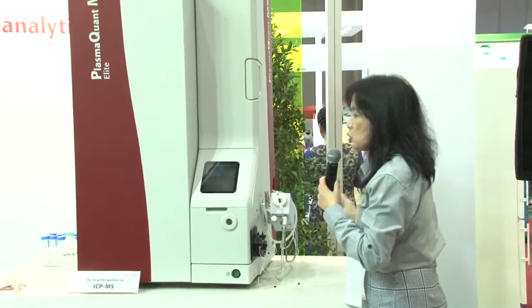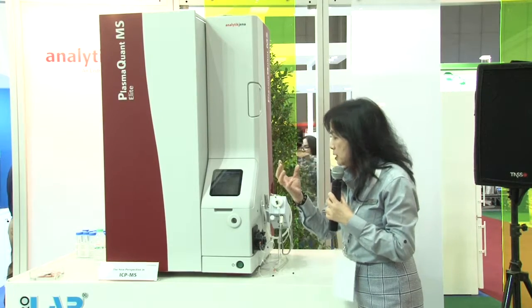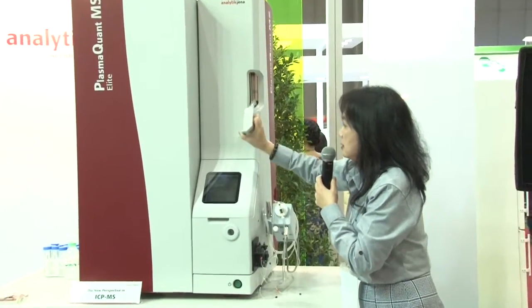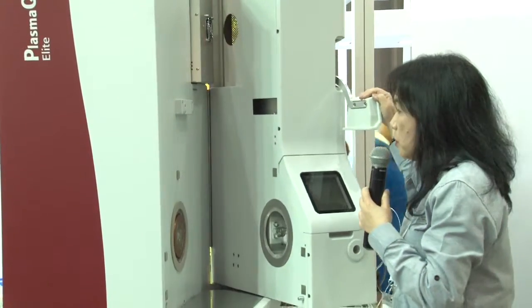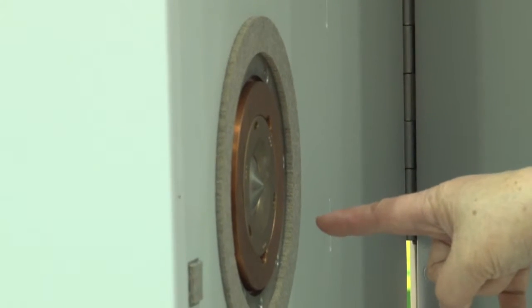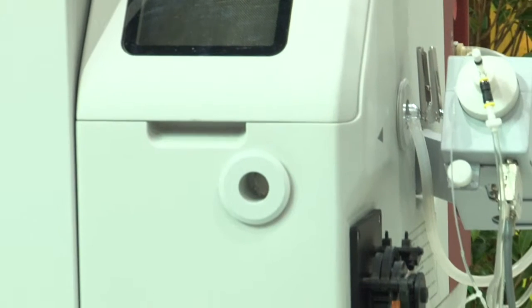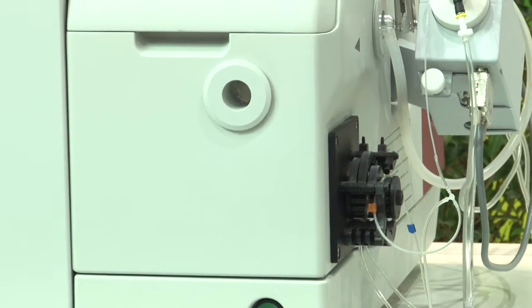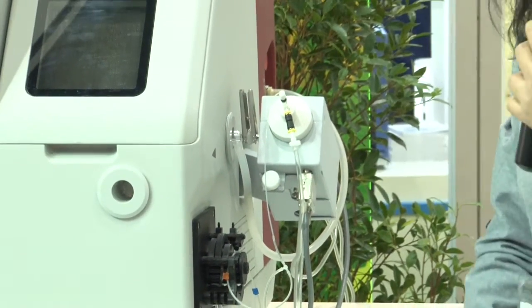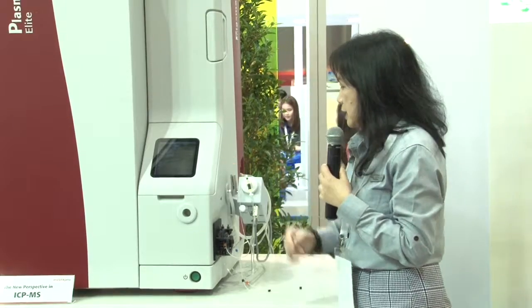After we measure all the samples and all the calibration standards, if you wish to do maintenance, the only maintenance you need to do is the cones. It's so easy. I just pull the lever and open up. It's like an open book. Then you see the sample cone and the skimmer cone. After you clean them, take them out, and put them back on, you close the door and continue running. Of course, you don't need to clean the cones every time; I just show you how you do the maintenance. It's very simple and easy. Operating ICP-MS is not as difficult as some people might think. Although people think ICP-MS is so difficult and high tech, it's very simple and easy.